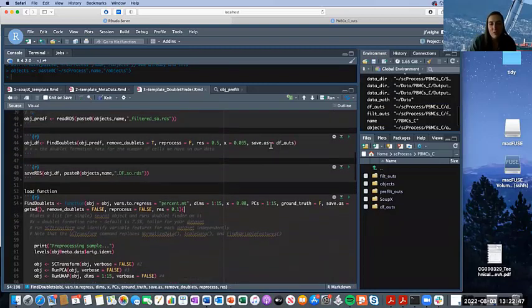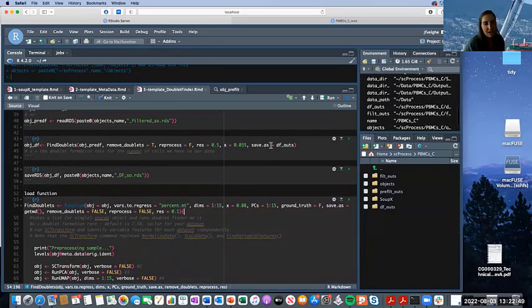For these cells, we expected 500 cells. We loaded on 1,600, but we're expecting 500. So for the number of cells we had loaded, we would want to put a variable in that accurately represents that. So I actually put this in based on 500. So that's 0.035, or 3.5%. Okay, so that is one variable that you will change based on your data.